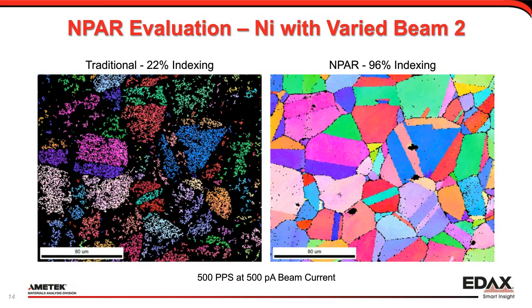Another example: by changing the beam parameters, we now go to 500 patterns per second at only 500 picoamps of beam current, which is still pretty low. Traditional methods show not really much there — your eye picks up some colored regions for the grains but it's really not too good, at only 22% indexing. However, by applying NPAR on the diffraction patterns you collect, you get 96% indexing — very high quality. You obviously have some noise within the grain even after processing, but now you have data you can quantitatively measure for proper interpretation.